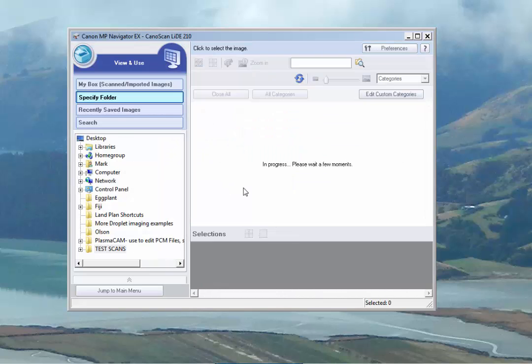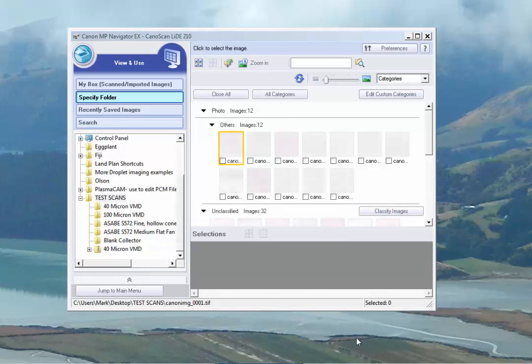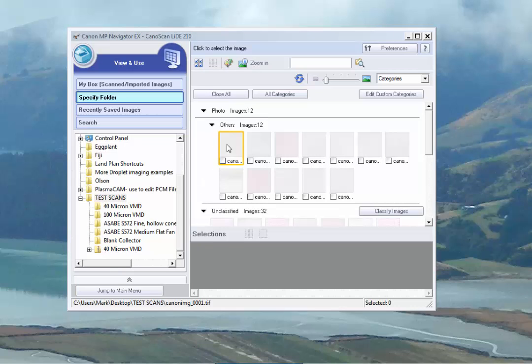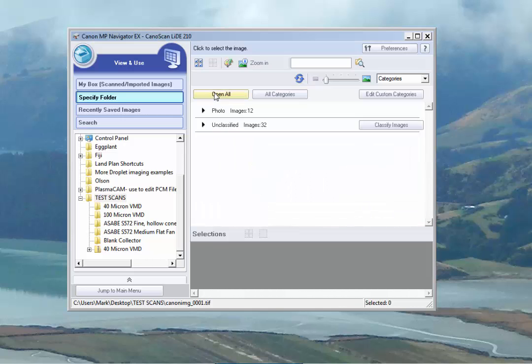And so here it's now converted those. Open that location. So we've opened the folder. It shows that, in fact, the 12 pictures that we just took are in the folder. So we can just go ahead and hit close all.